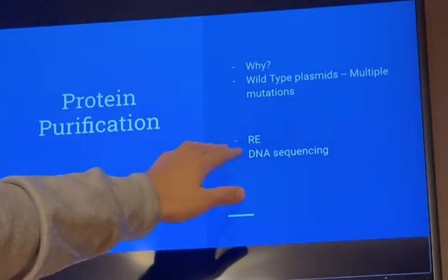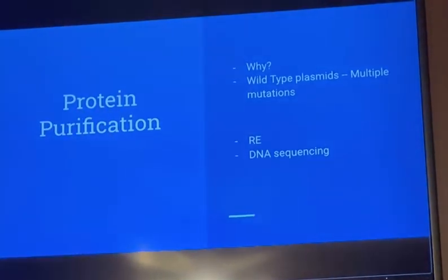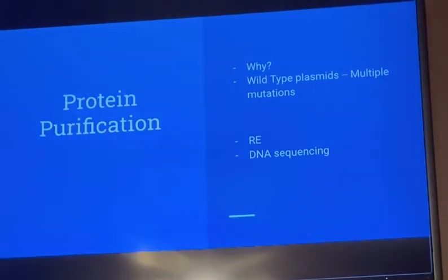We are going to do protein purification right there. We are going to select a colony. We're going to add buffers to it. We're going to make sure the antibiotic's there so the selection maintains.